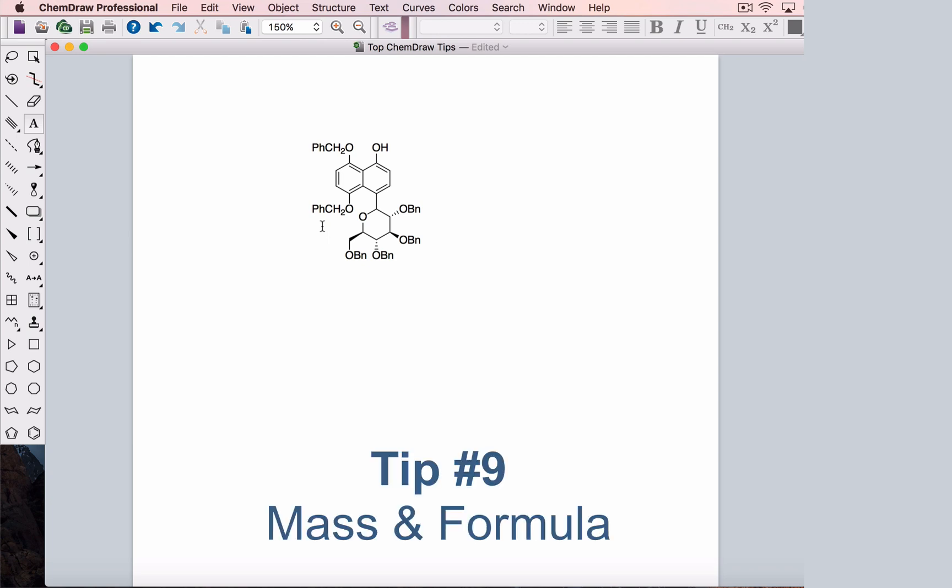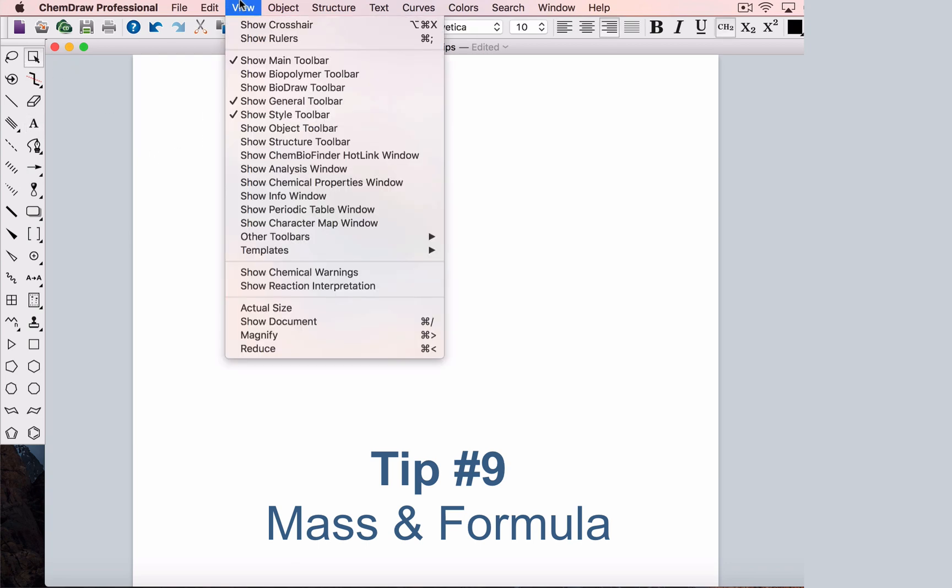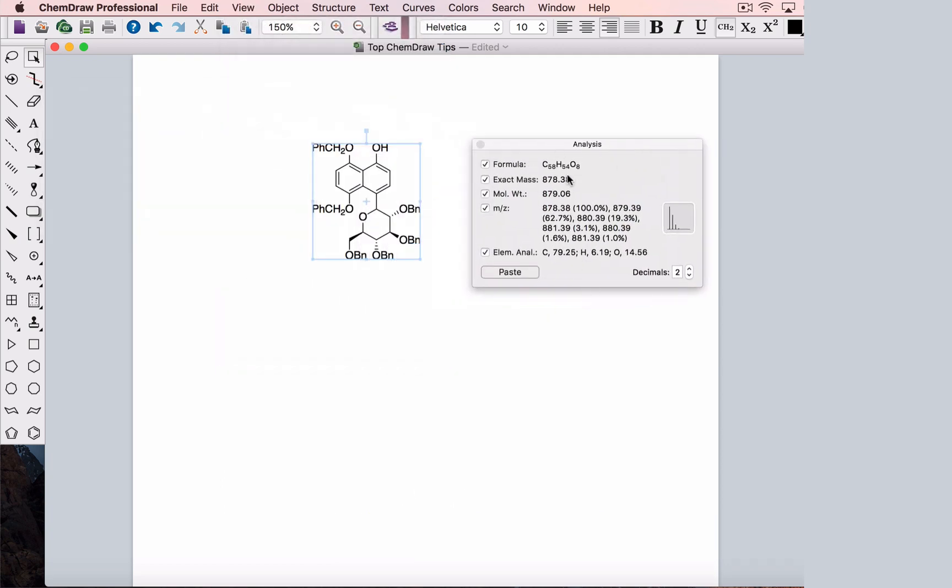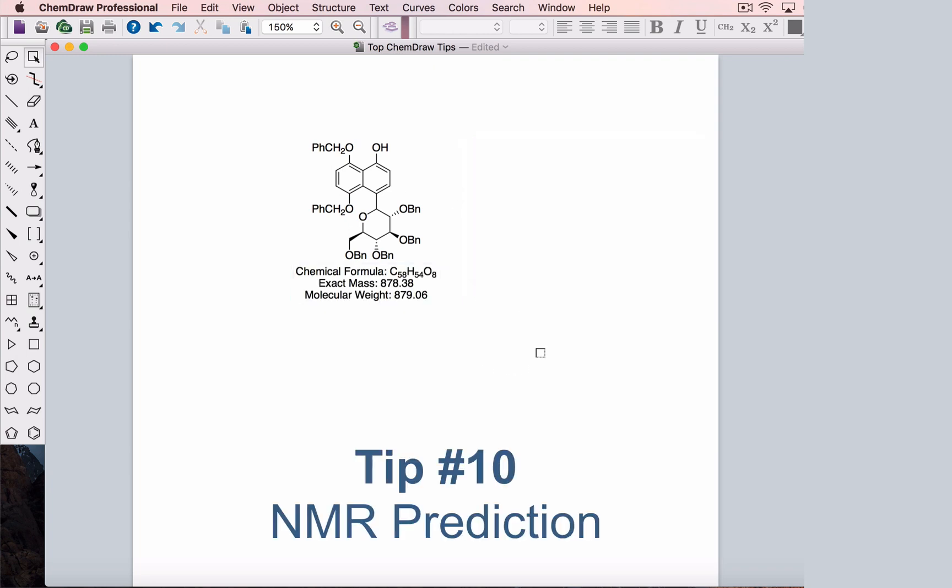Let's say this is a new compound you just synthesized and you need to get a mass spectrum to see if you've actually made what you think you made. You'll need to know the molecular mass and you can calculate this quickly by selecting view and show analysis window. You can paste this info and if you don't need all of the data, you can deselect the items you don't need pasted.